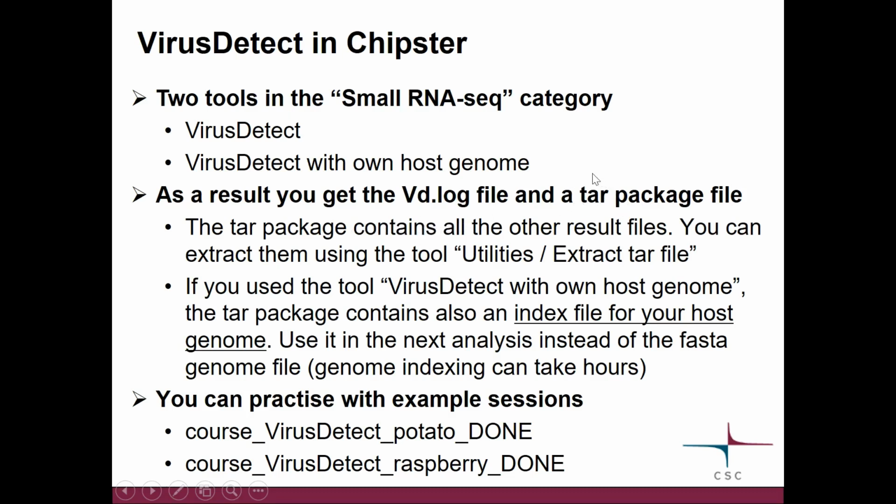The reason why we give you a tar package instead of zillions of individual files is that this allows you to decide yourself which ones you want to look at without the interface getting too messy with many files. So you can extract result files from this package using a tool in the utilities category called Extract tar file.